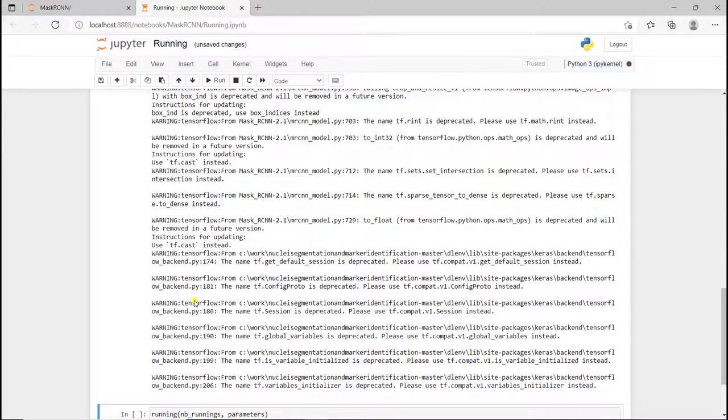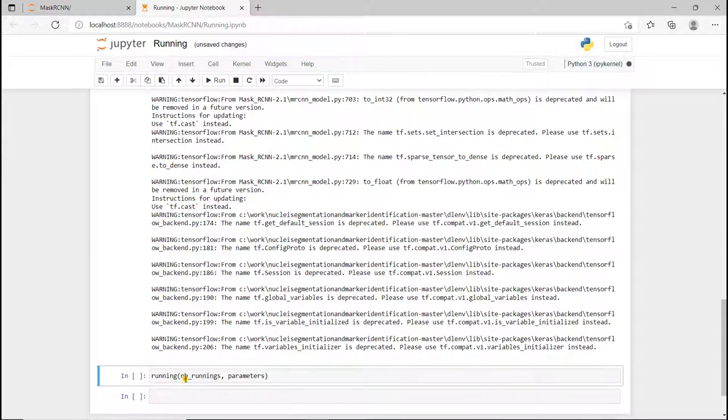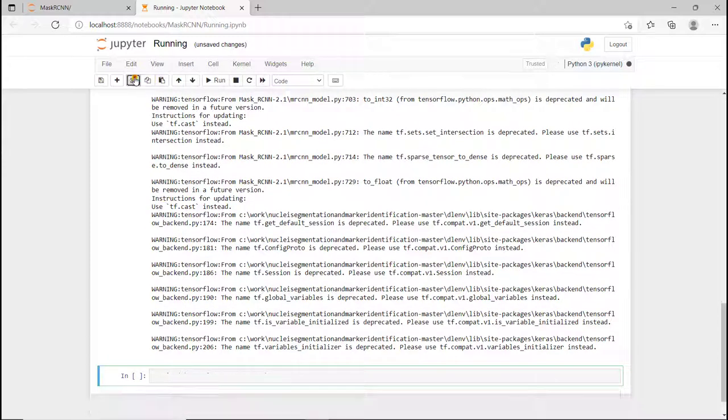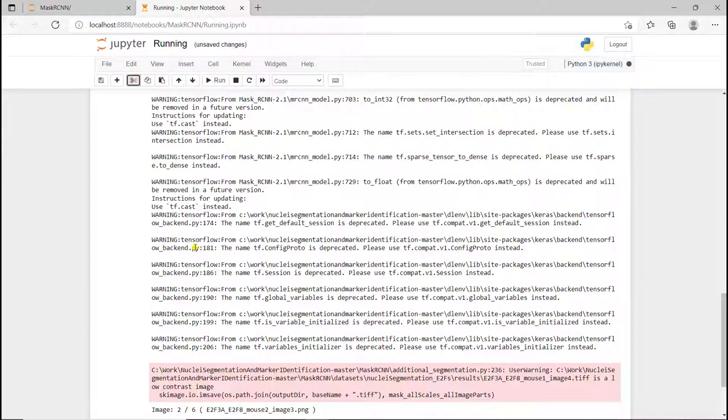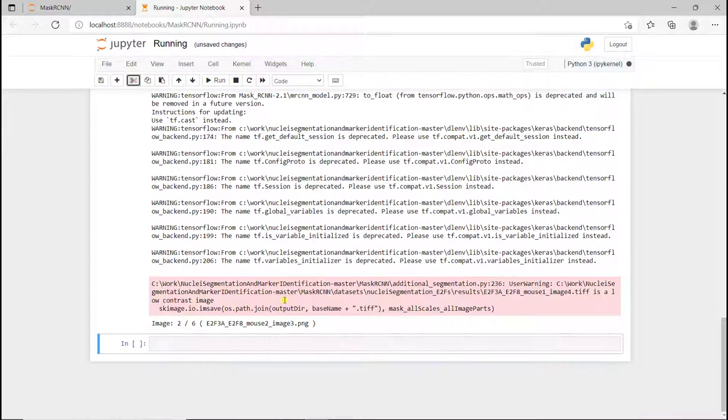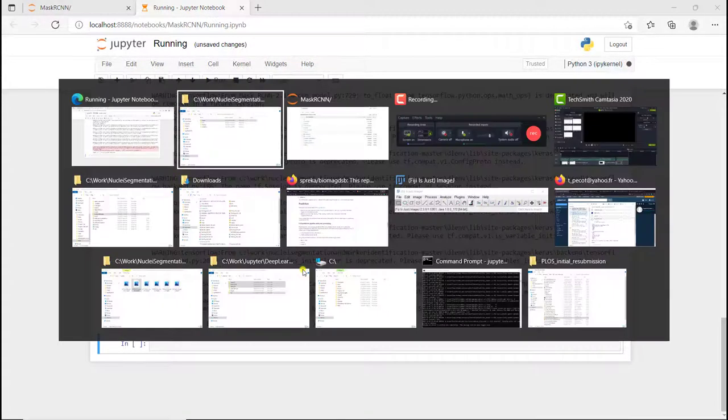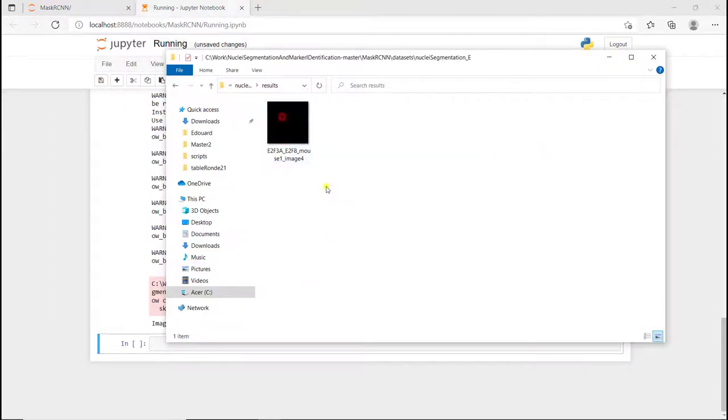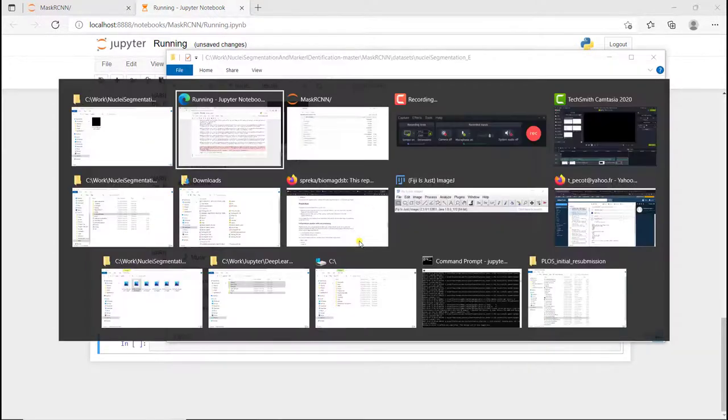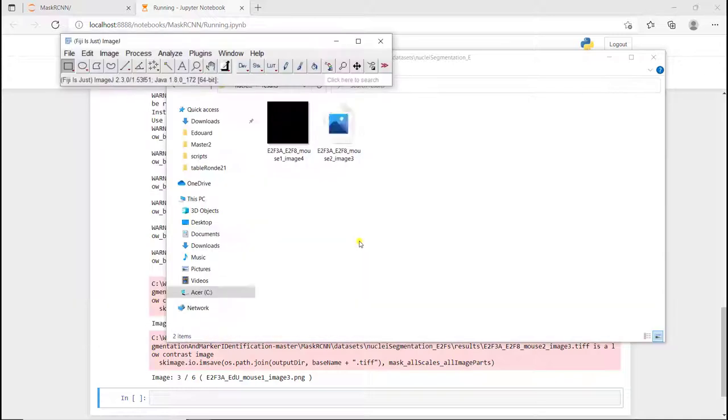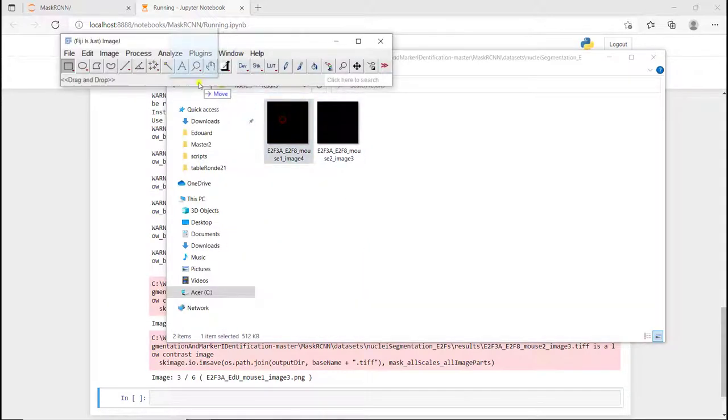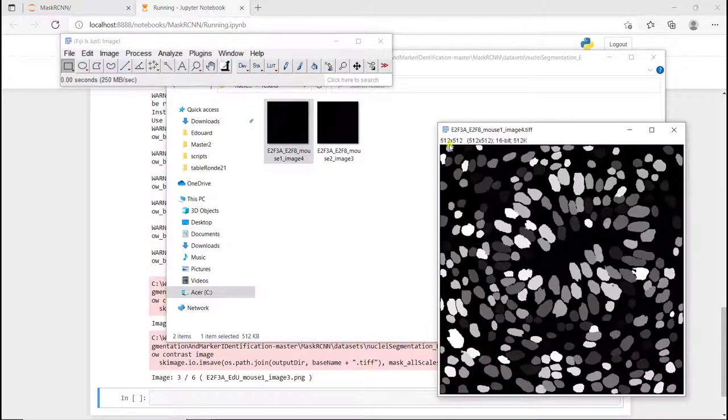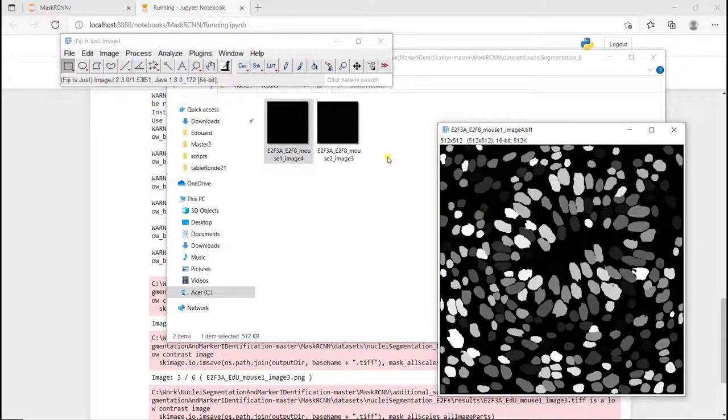The first image is processing. It's going to take a little bit more time. The second is being processed. It takes more time to process Mask R-CNN than U-Net or Stardist. Here we have the results.